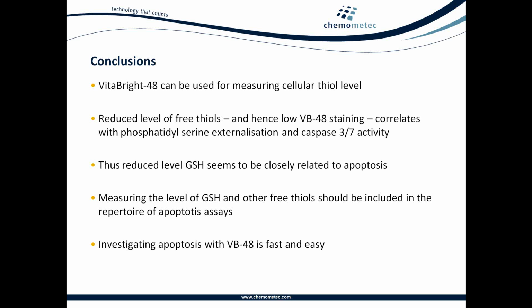So the conclusion here is that VB48 can be used to measure the cellular thiol level, and the reduced level of free thiol, giving a low stain of VB48, correlates with either phosphatidylserine externalization or caspase 3/7 activity. So we now know that this correlates with other apoptotic measurements, so we say this is an apoptotic measurement, however slightly later than the annexin 5 and caspase assays.